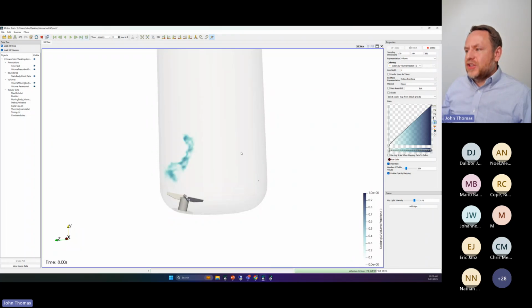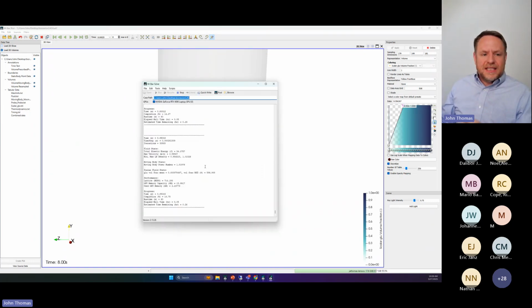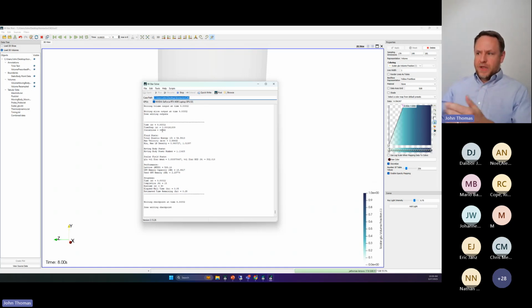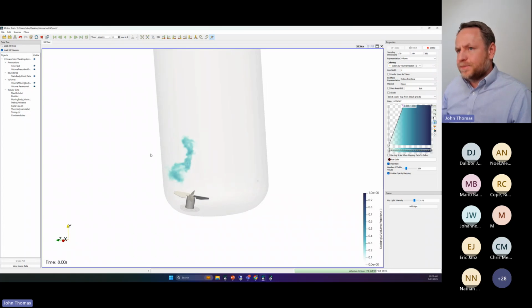But I can see again this glucose started to move on down and get homogenized across the system, which is what happens physically. And again, the important point is, guys, I'm doing this all in real time. This isn't a pre-canned solution. I'm pulling this data off the GPU as it's being evaluated by the GPU and visualizing it now.